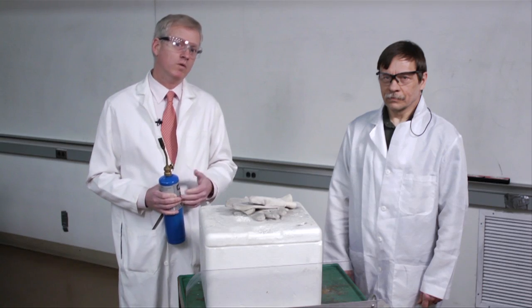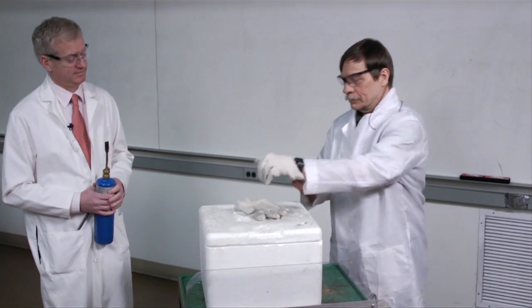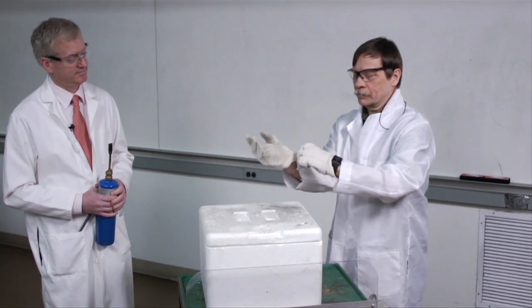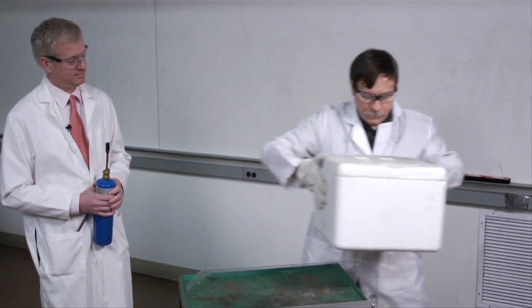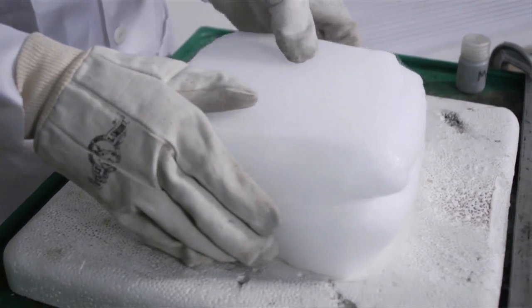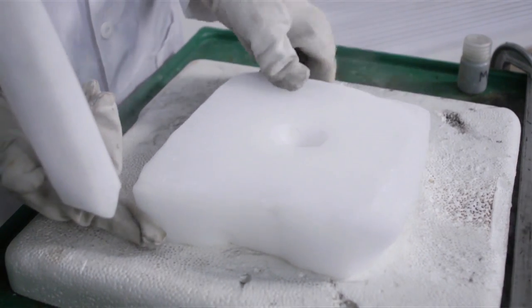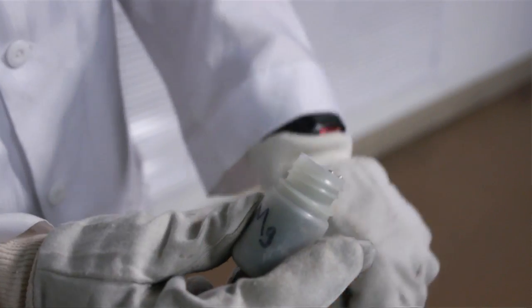In practice, the reaction is a bit more dramatic if instead of gaseous carbon dioxide, we use solid carbon dioxide — that is, dry ice. So, we have here a slab of dry ice. In this lower block of dry ice, we've chiseled out a small hollow, and we're going to fill that hollow with some shavings of magnesium metal.